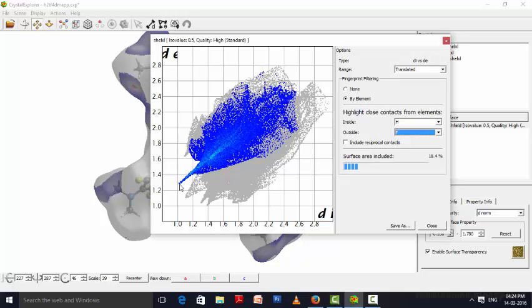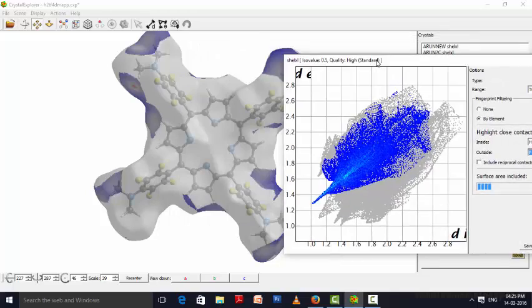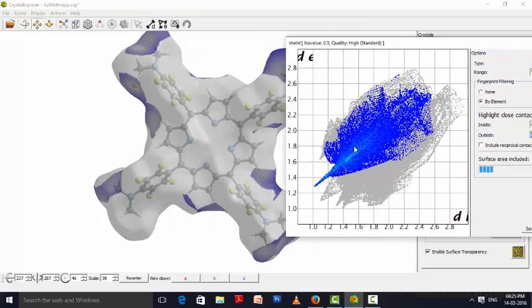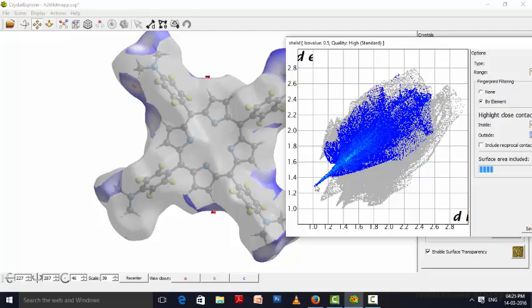Where you can get the minimum distance: to the external atom it will be around 1.3, and to the internal atom that will be around 1.0. And simultaneously where this interaction is happening, you can see this interaction is specifically happening in these two areas. The spikes are coming while I have touched the spikes here, when I click the mouse here.